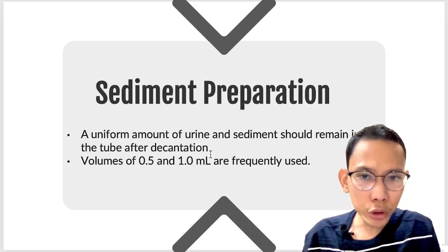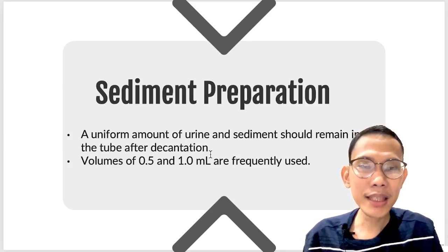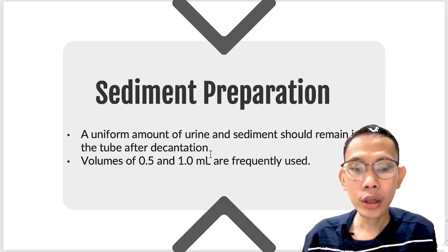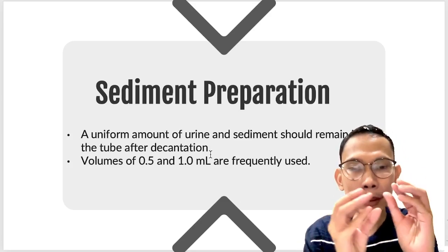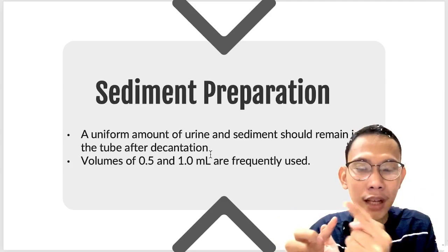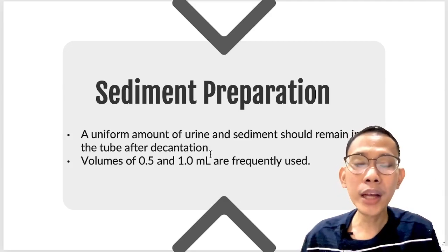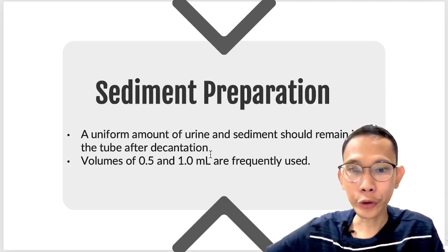Thorough resuspension is also essential to provide equal distribution of elements in the microscopic examination fields. Again, there must be a thorough resuspension. So again, dapat yung sediment na na-form natin sa ilalim, dapat mag-suspend siya sa buong naiwang supernatant para equally distributed siya when we do the examination later on. Okay?